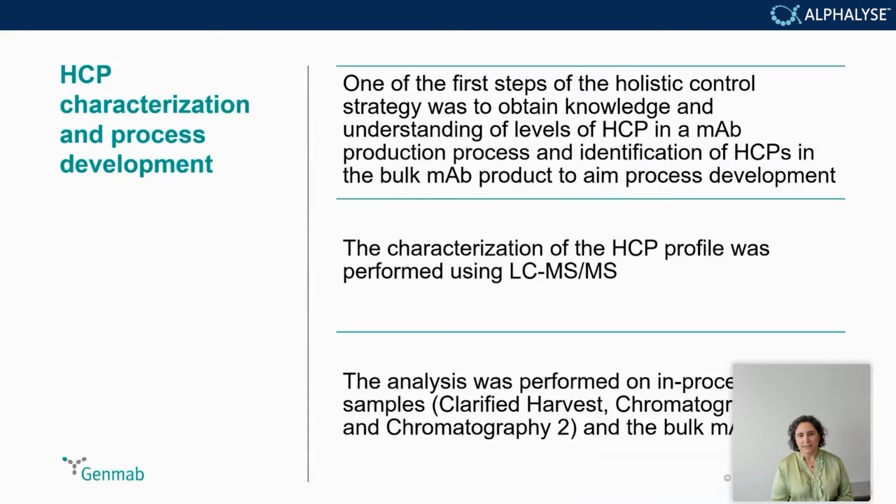in the process. So for that, we use characterization of the HCP profile by LC-MS, and the analysis was performed on in-process samples for clarified harvest, chromatographic step 1, chromatographic step 2, and the bulk mAb product.